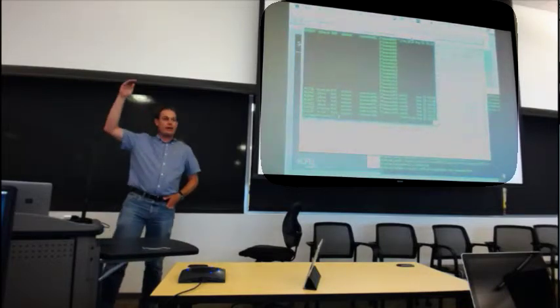You have a home directory where you save things, and there's the experiment Scratch directory. Your home directory is on slower disks and has a quota. If you process data there, you're going to clog things up and wonder why. It's like living in a small apartment and buying a lot of furniture. It ain't going to work. So data processed from the experiment should really go in Scratch. I think that's the message, isn't it, Jason? Jason might say it a bit better.